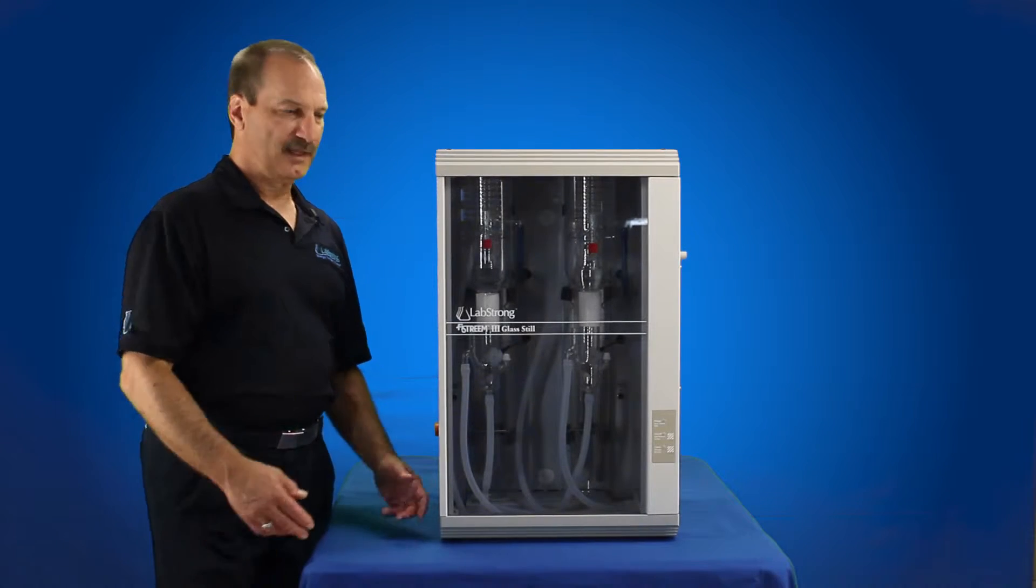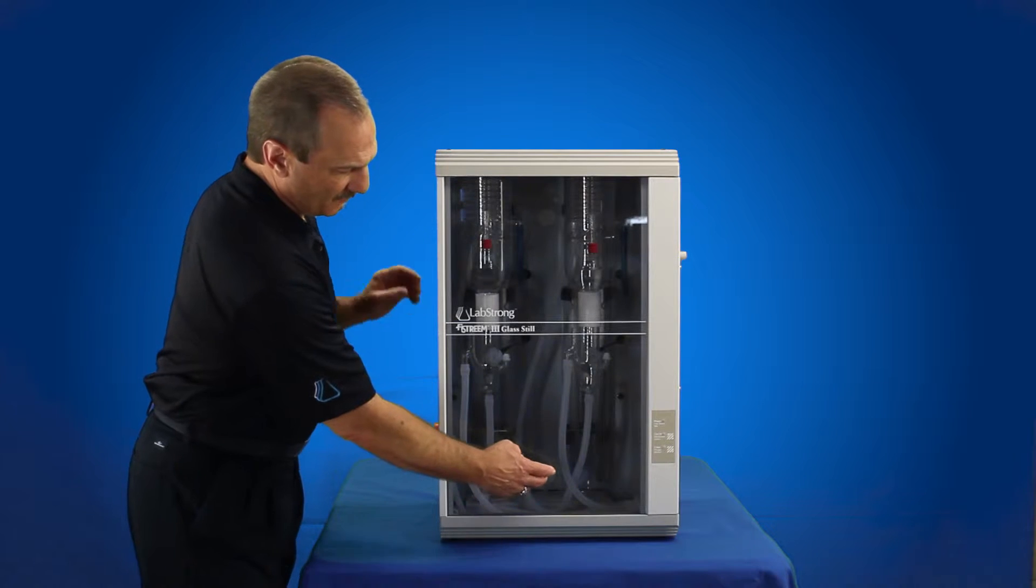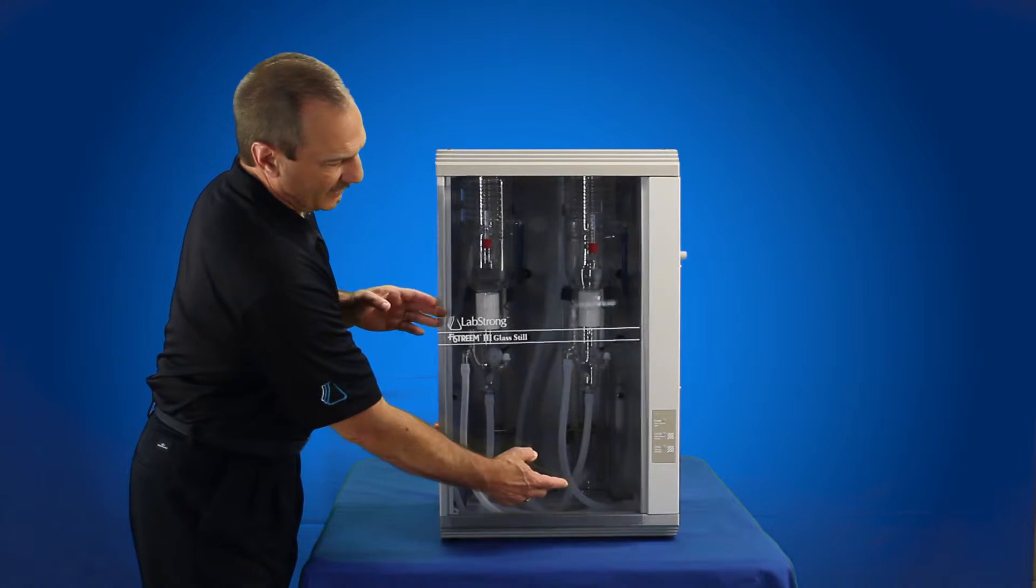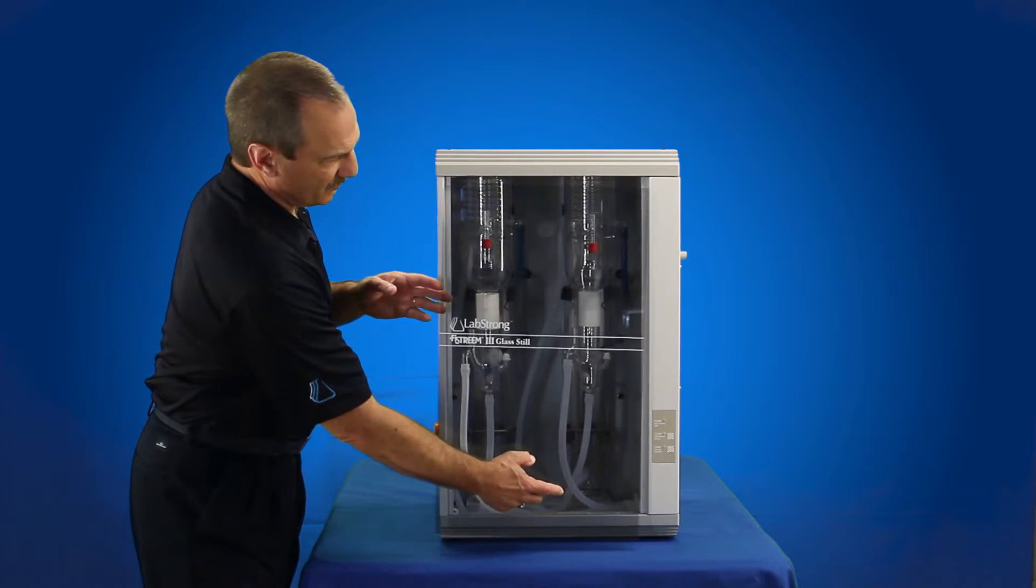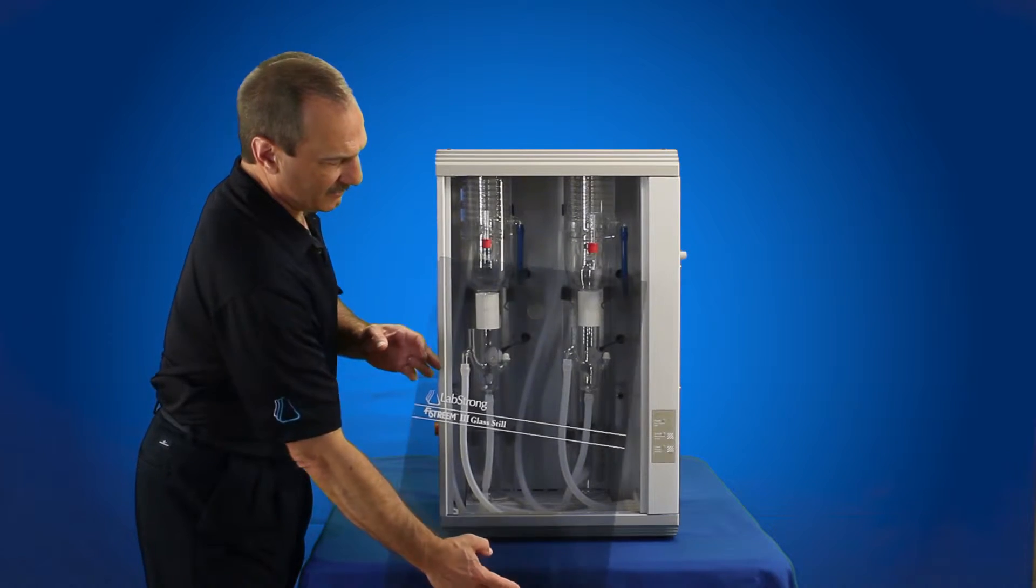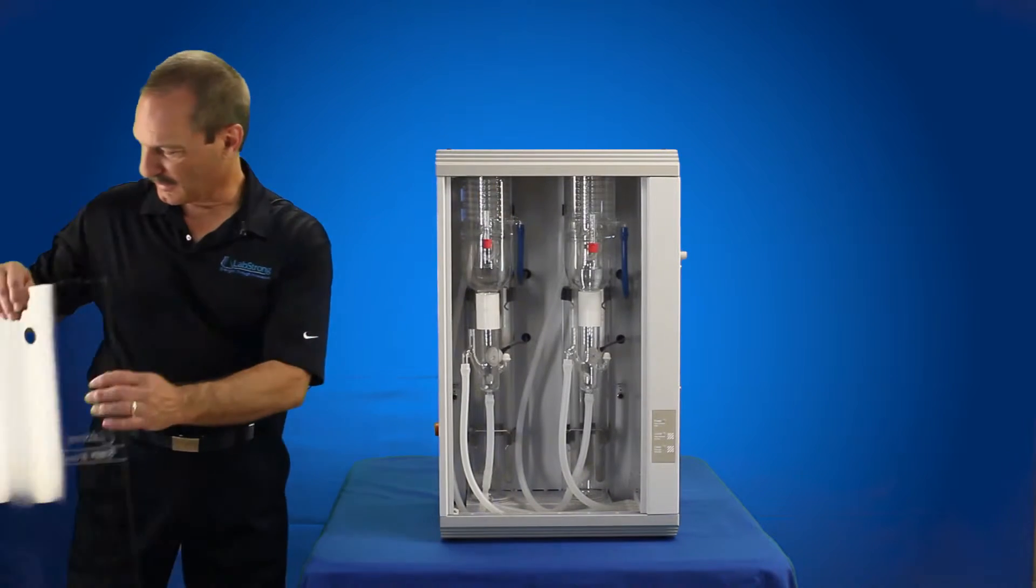Now we're going to remove the door from the 8 liter per hour Fikestream 3 system. The Fikestream 3, 4 liter per hour system single distilled has the same type of door, it's just a little smaller. You're basically going to lift up, pull out on the bottom, pull the top down, and remove the door. Set that aside.